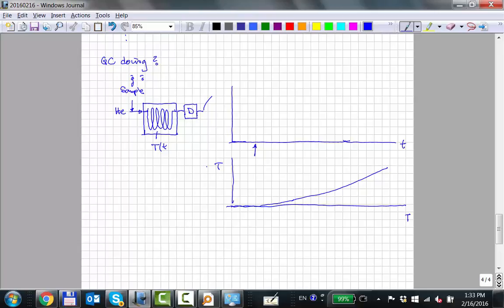So what happens is that when you reach right here, that temperature is above the vapor pressure of methane, or the temperature required to release the methane from the packing material, and it joins helium as a gas out the column. So now you've got the helium flowing, and all the methane that stuck to the column is now flowing with the helium.